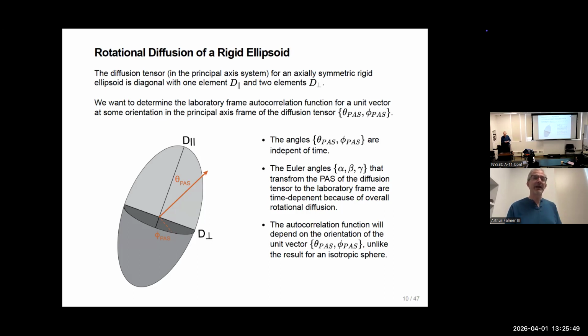And then when omega squared tau c squared is much less than 1, this is pretty much flat. So if we have an ellipsoid, either a flying saucer or an American football, then there are 2 diffusion constants, one for diffusion around the symmetry axis and then one around the other axes.